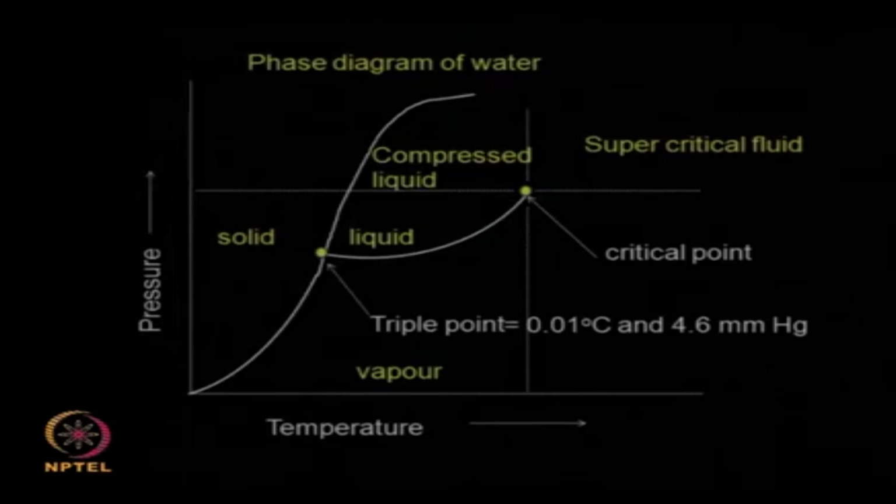So in this process you are not increasing the temperature unlike drying. The material which needs to be dried is completely being operated at low temperature, so it does not get denatured. It is a very useful technique, especially for proteins, especially for plasma and so on.